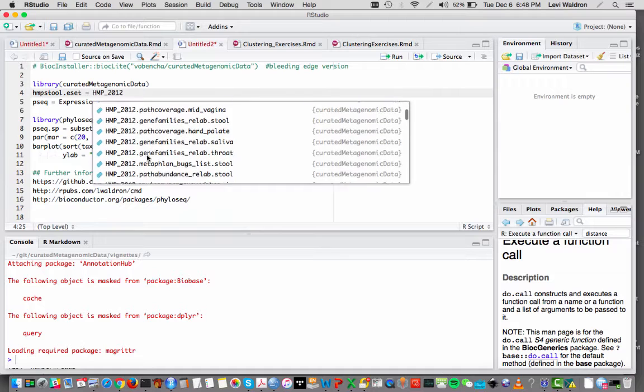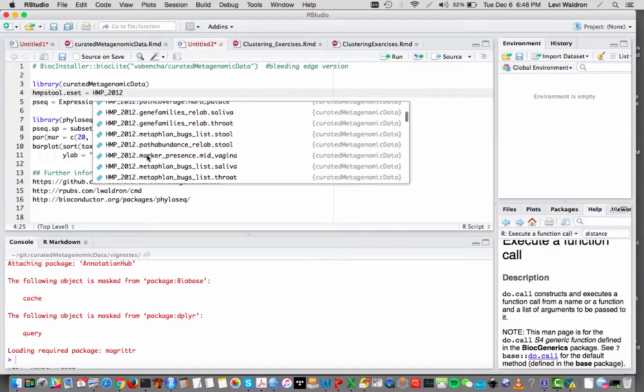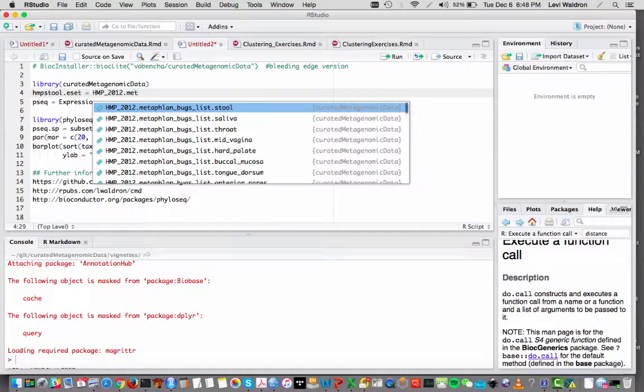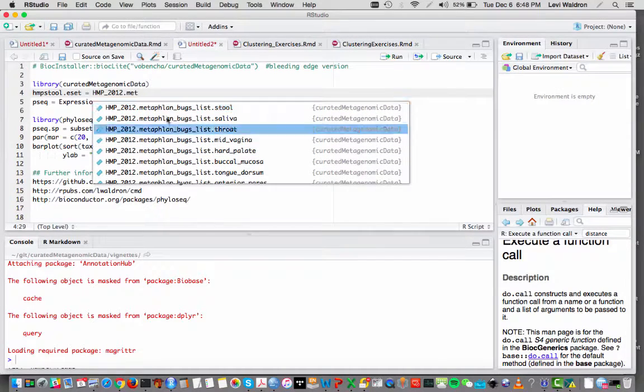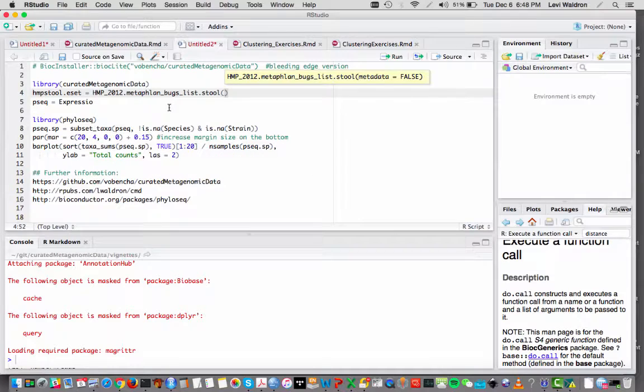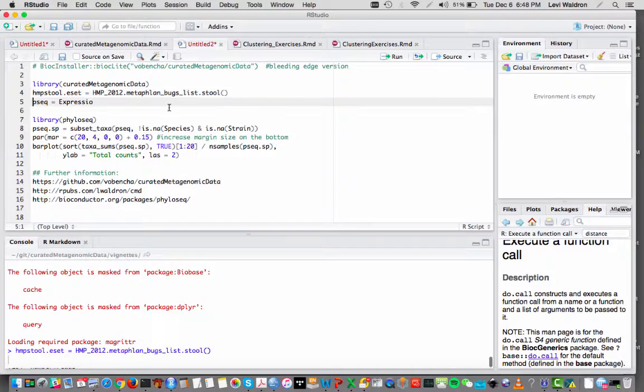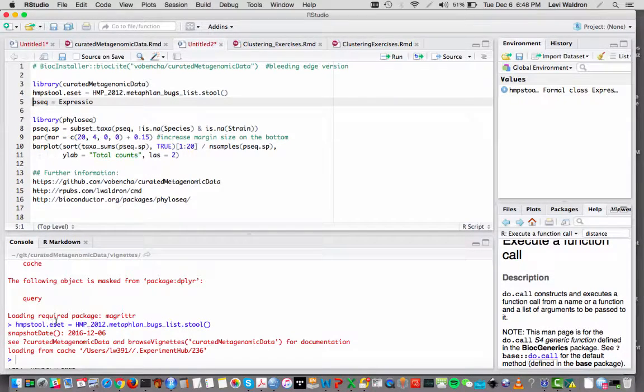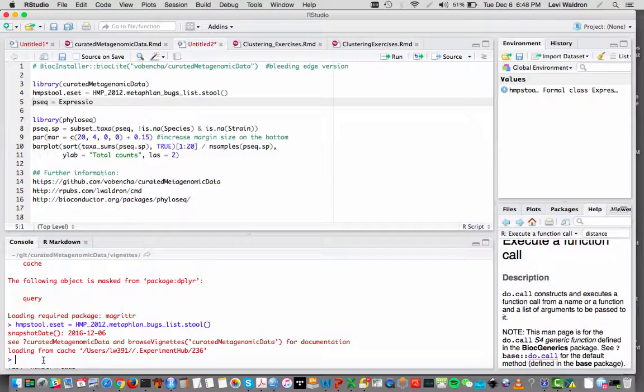And what I want is the MetaPhlAn bugs and I want it for stool. So running this function, I get an expression set for the HMP stool dataset.